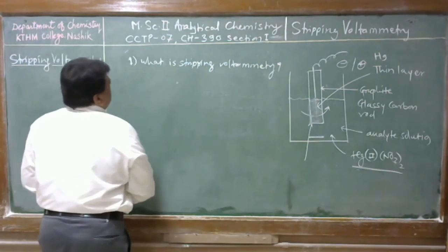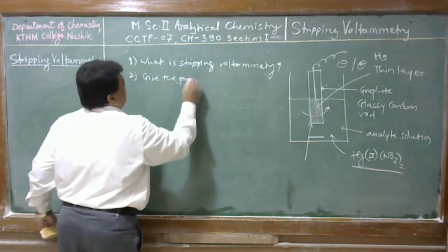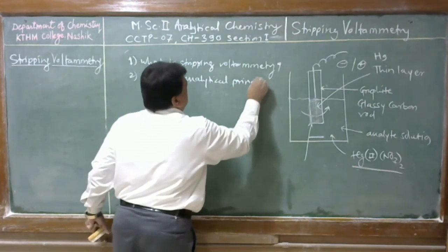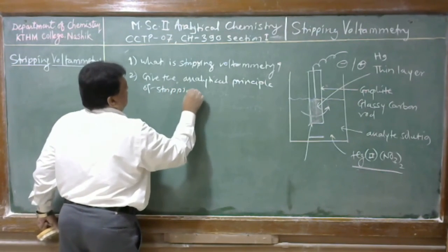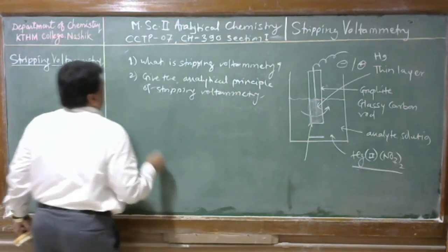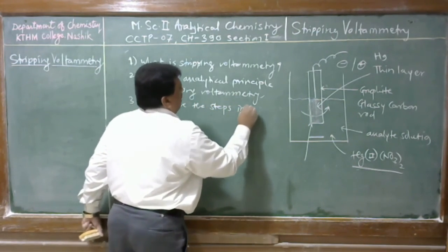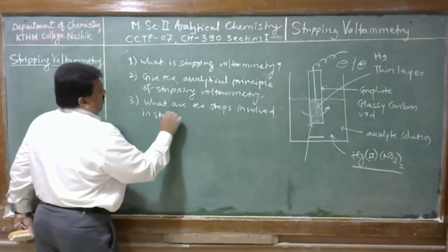Give the analytical principle of stripping voltammetry. What are the steps involved in stripping voltammetry?